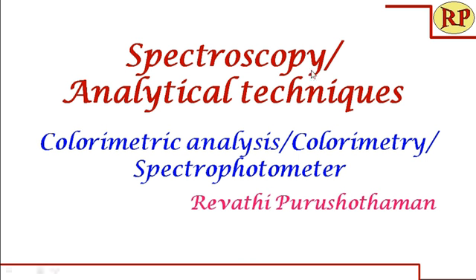Welcome to another session of spectroscopy or analytical techniques. Today we are going to look into colorimetric analysis, which is also called colorimetry, which is nothing but spectrophotometry.